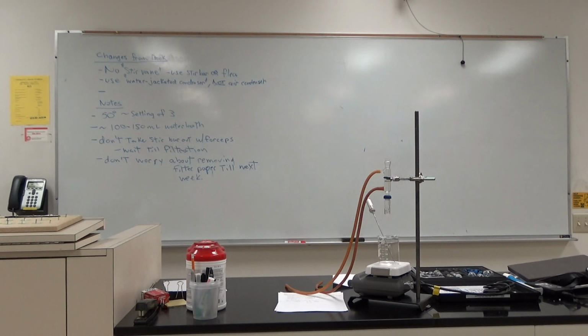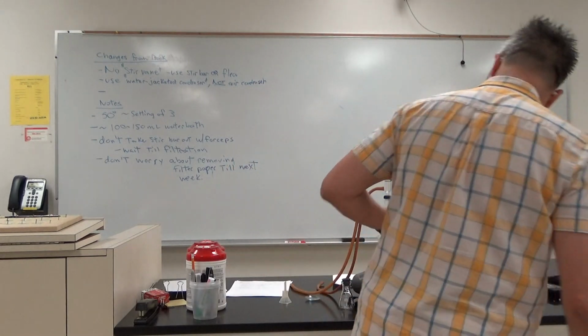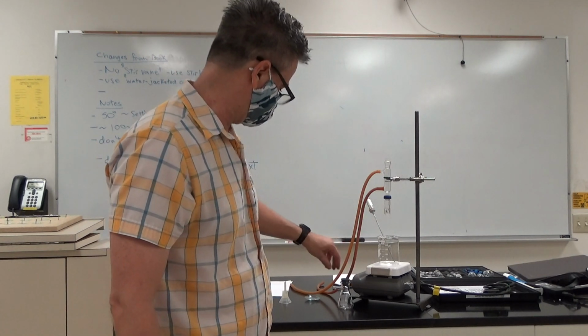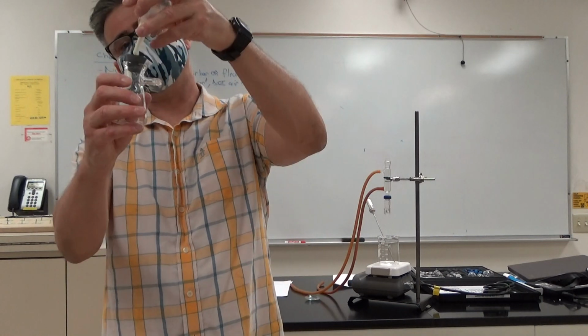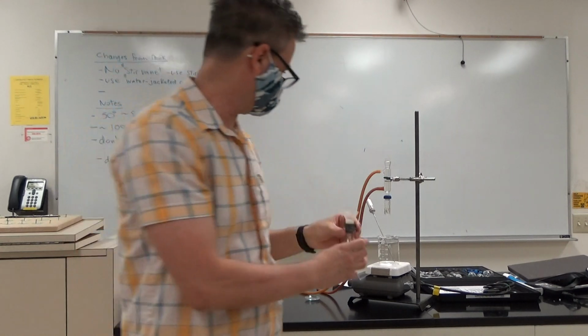This is a little bit of a long pre-lab. We won't need to do pre-labs this long ordinarily because a lot of these setups we use repeatedly. Okay. All right. So we've got our crystals in there. All right. And so now we're ready to filter them. Okay. So we make sure that we have this ring here. We make sure that we've got our Hirsch funnel, okay, like that.